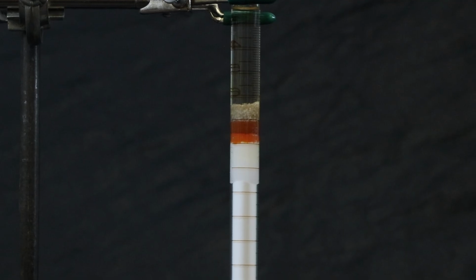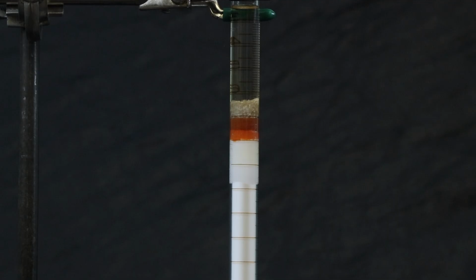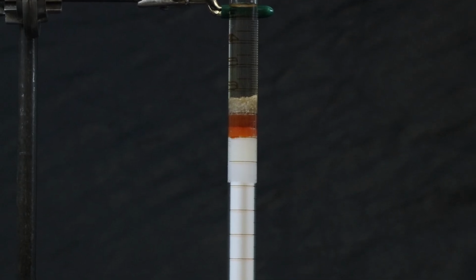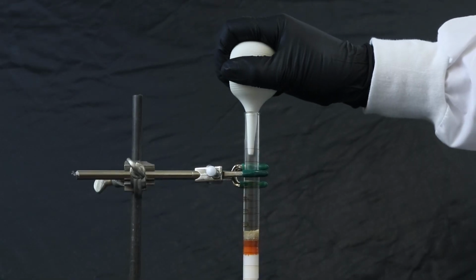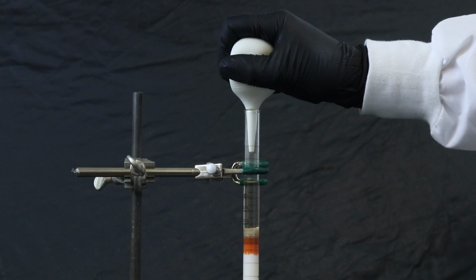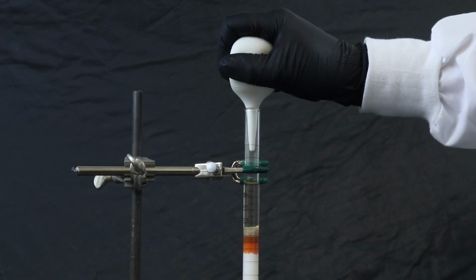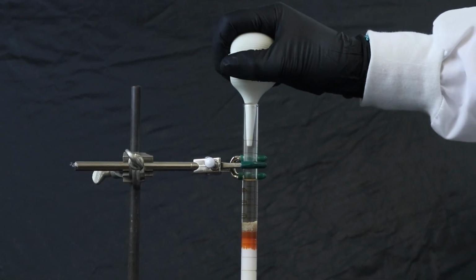You can see the product starting to dissolve here, and you can also see the solvent slowly moving through the column. I'm going to go ahead and speed up that process using a bulb. I'll create a seal as best as I can and start compressing to push the solvent through, making sure to break that seal before sucking air back into the bulb so as not to pull the solvents back up the column.